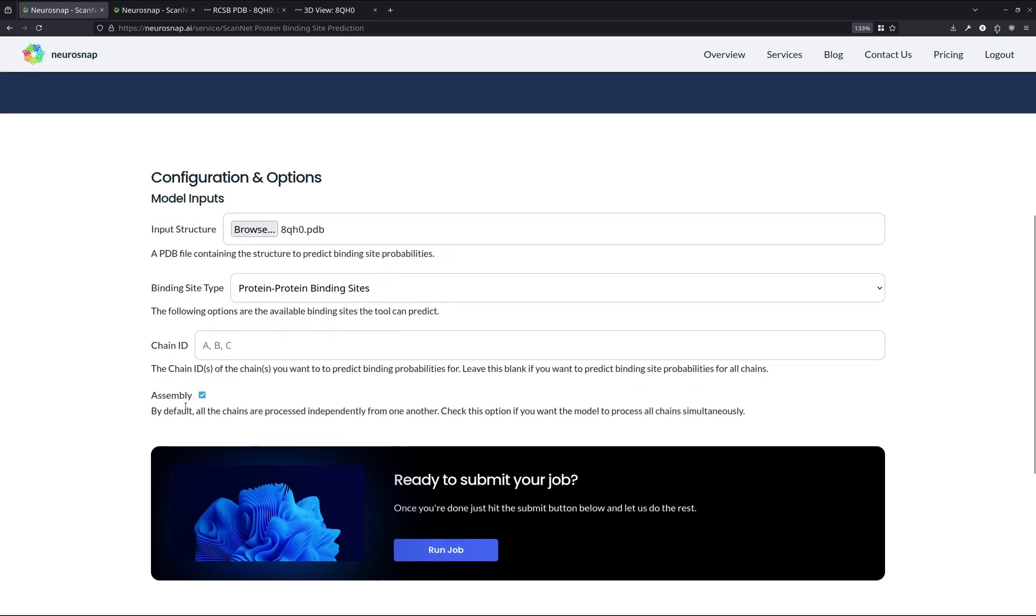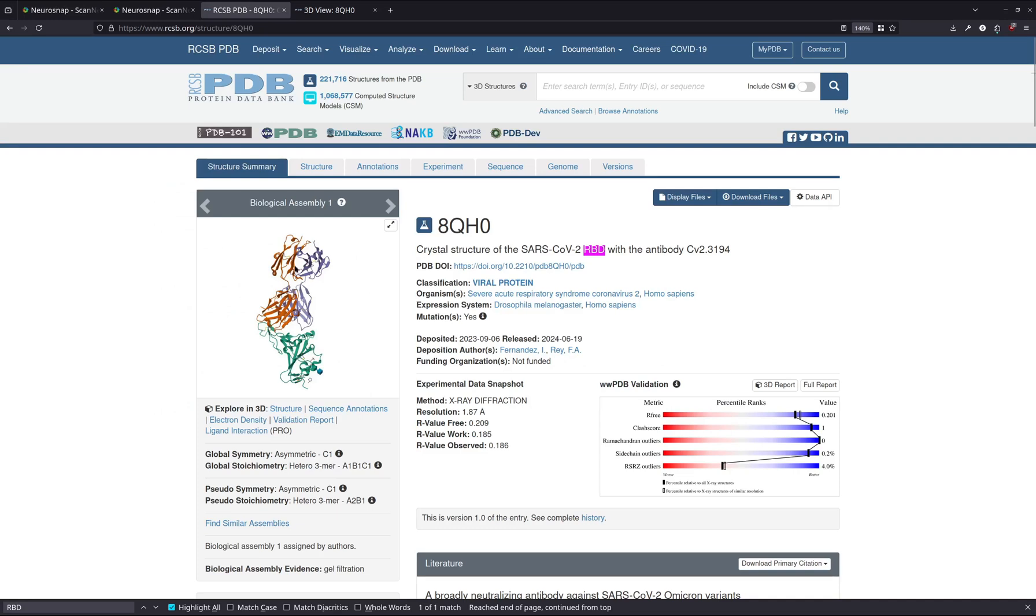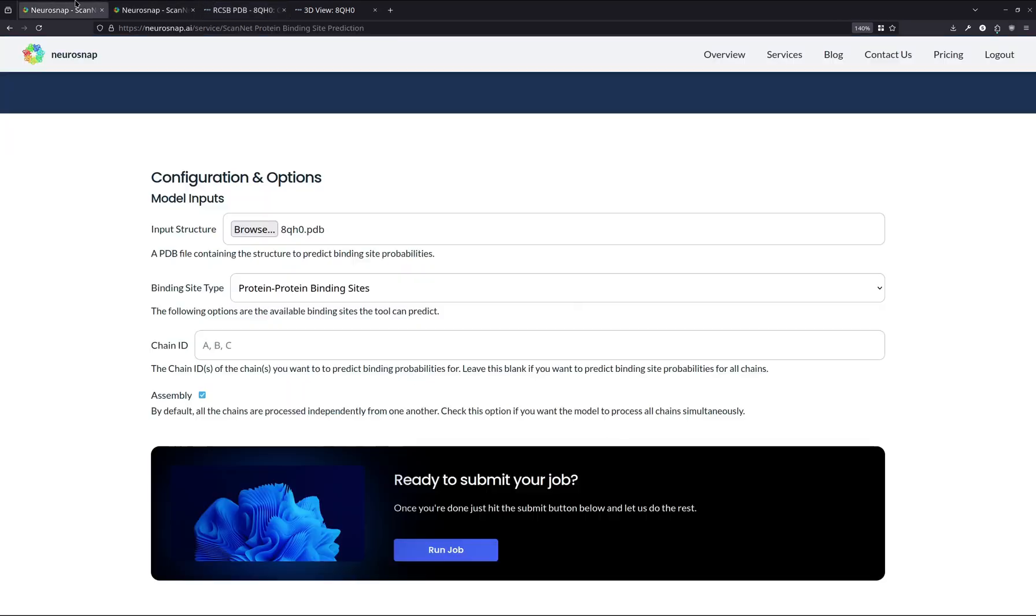For assembly, this one is a little bit more complicated. If we go back to this structure, as we can see, there's multiple chains. And essentially, ScanNet has two options. Either it can consider the inter-chain interactions, or it can completely ignore them and pretend that every single one of these proteins are in a monomeric state and there's no binding domain or anything like that.